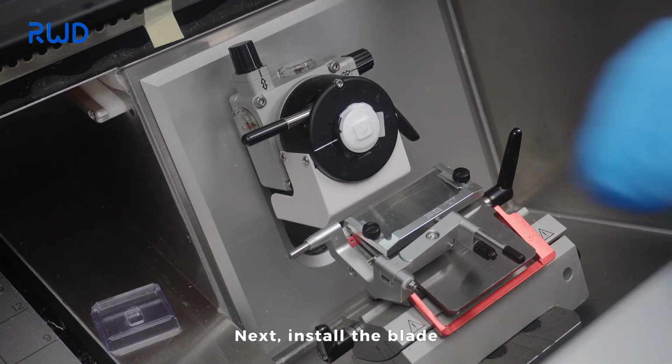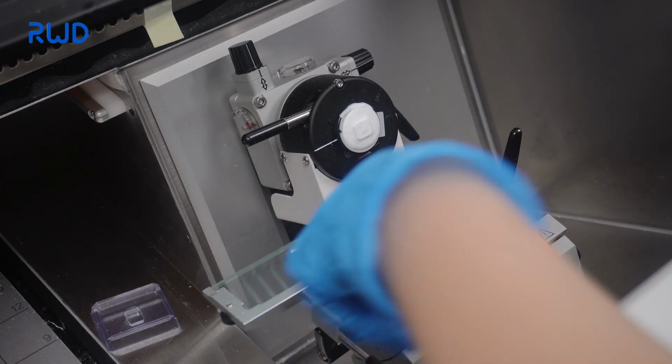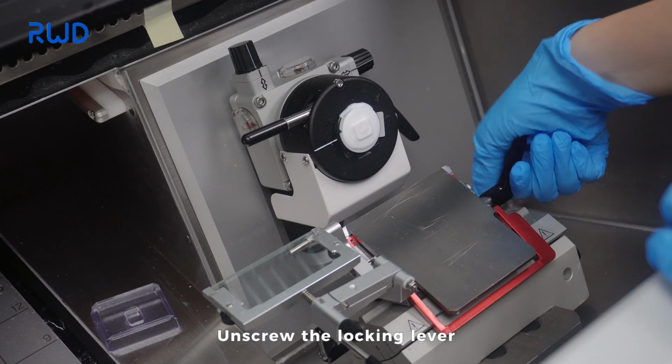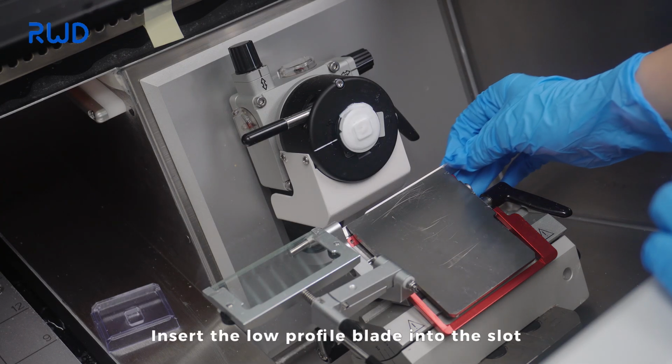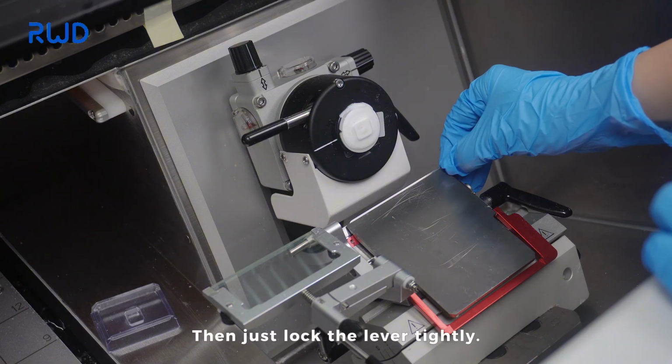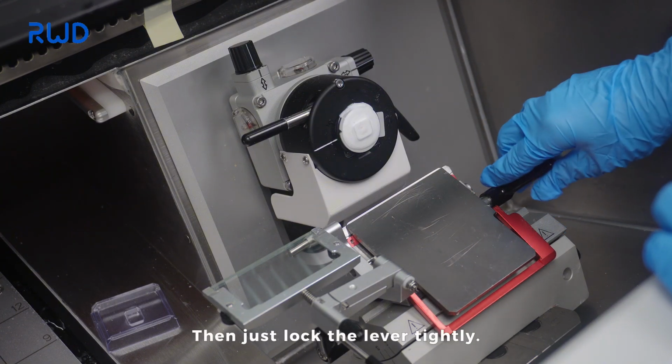Next, install the blade. Flip open the anti-roll plate. Unscrew the locking lever. Insert the low-profile blade into the slot. Then just lock the lever tightly.